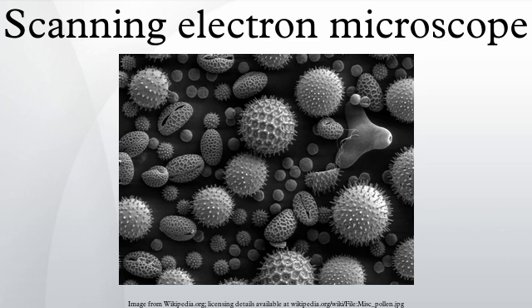Beam injection analysis of semiconductors. The nature of the SEM's probe, energetic electrons, makes it uniquely suited to examining the optical and electronic properties of semiconductor materials. The high-energy electrons from the SEM beam will inject charge carriers into the semiconductor. Thus, beam electrons lose energy by promoting electrons from the valence band into the conduction band, leaving behind holes. In a direct band gap material, recombination of these electron-hole pairs will result in cathodoluminescence.